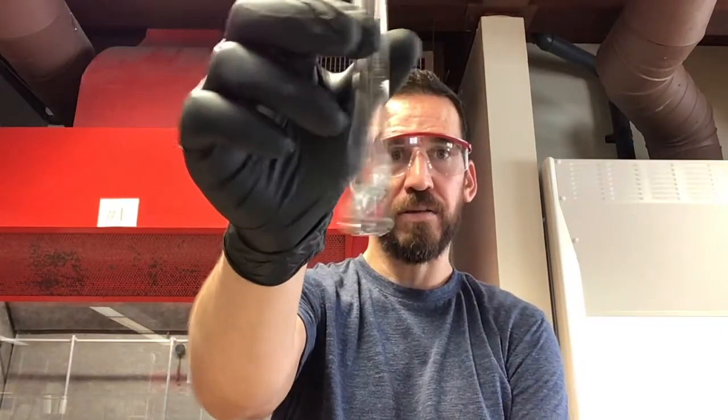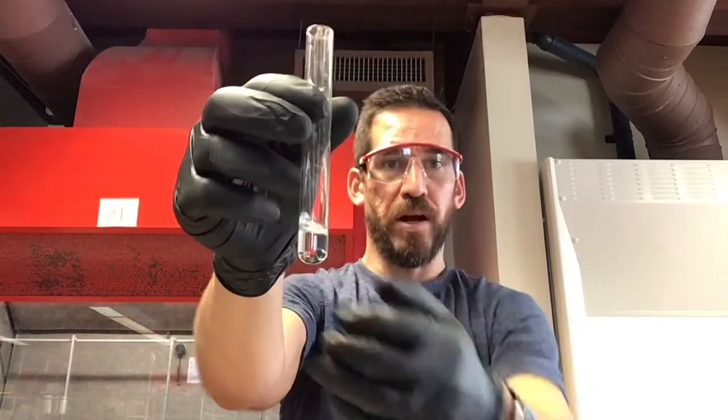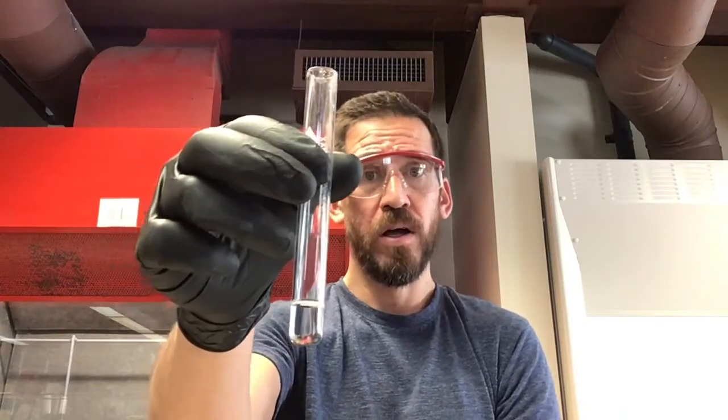And if it does, let's say methyl and primary, those occur much faster than secondary, right? And so when we're recording our approximate time on how long this took, we also want to see if it goes along with that trend as well. Okay, so we're applying everything we know about Sn2 into these 10 reactions right here.